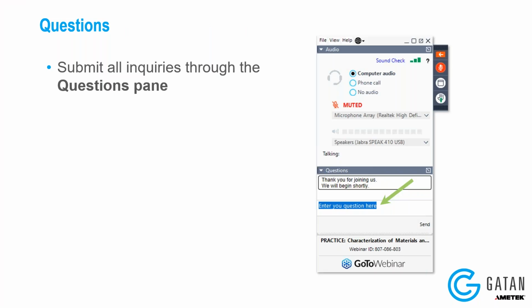If I assume that all of those electrons are going to go into the center spot, then I can decrease my intensity so that even if all those electrons went into just a few pixels, I would still be okay, and I wouldn't be damaging my camera.